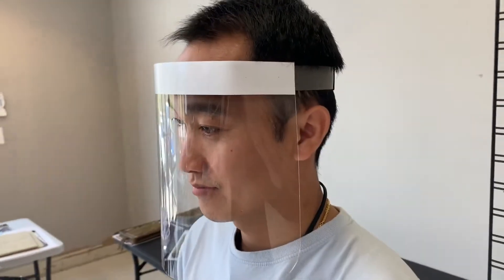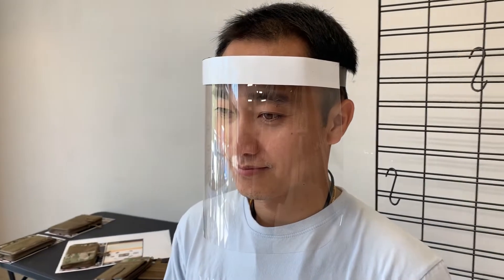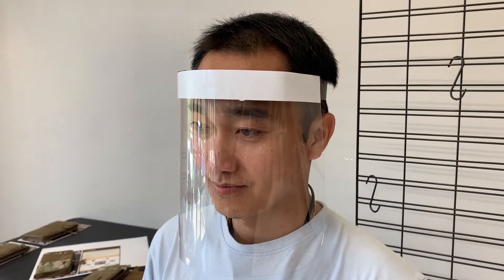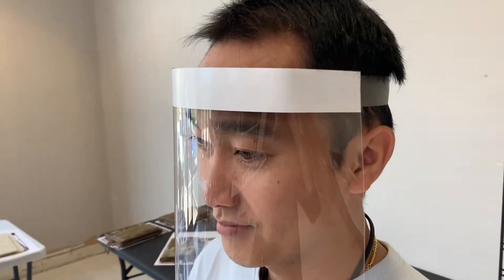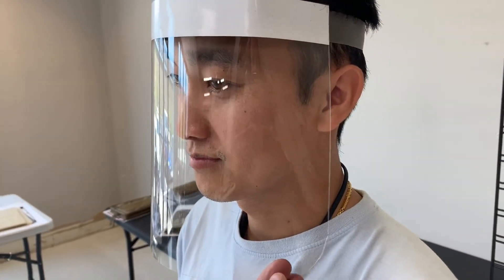Hello, Mark Wheeler here. I just want to show you the Lexan face mask that we have designed here at the shop. The Lexan is .010 Lexan material, acrylic.